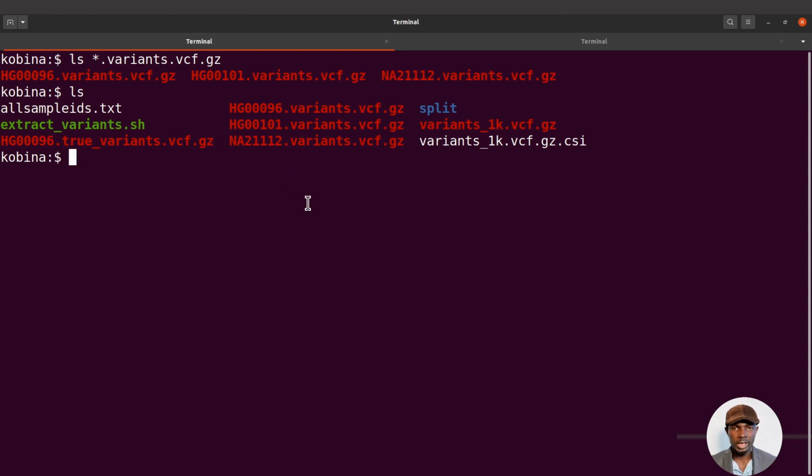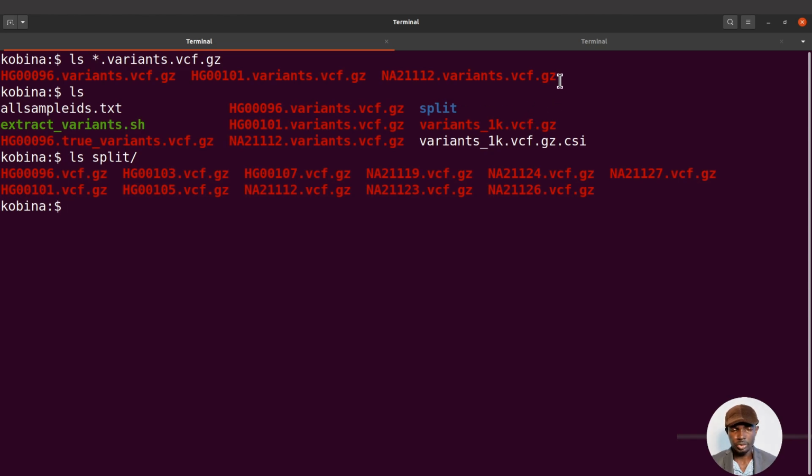So now let's compare the variants in the split directory to what we have here. I mean, we did it, but let's do it again. This time, let's use a different sample. So let's say we have this one here, or you can even use this one. You can use any sample of your choice, it's fine. I'll say bcftools view. We are dealing with individual samples here, so we don't need a -s. Okay, so I'll say bcftools view, and then I'll do this.